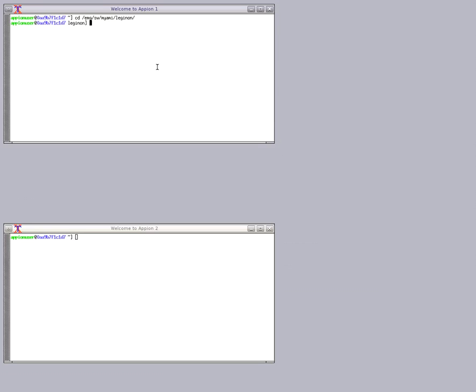Hi, I wanted to post a quick update to the lacey carbon hole detector in Leginon, the autofocus hole finder. This feature requires Scipy 0.12 or higher, so if you're running on CentOS 6, which only comes with Scipy 0.7, you'll need to upgrade at least Scipy, which can get a little hairy with Python 2.6, so it's more recommended for CentOS 7.